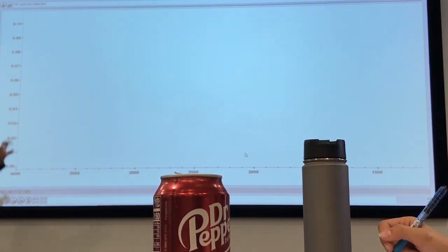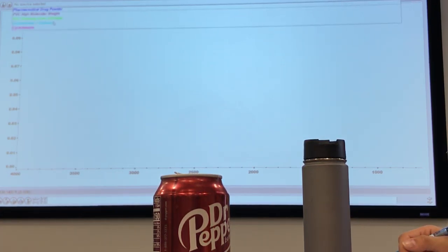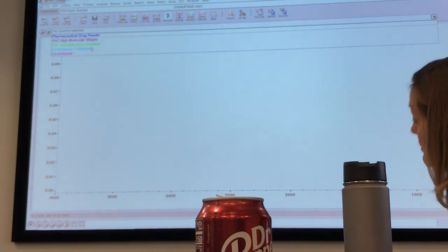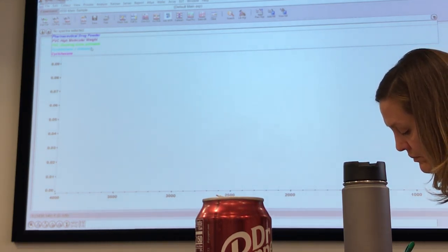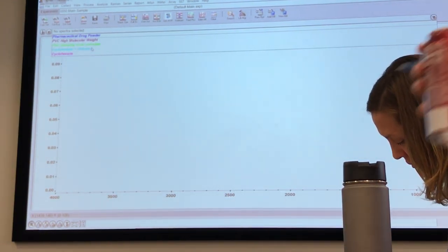That's why I want you to get more familiar with Omnic by itself and what it can do for you. So what we will do right now is take it as if we have run a spectrum. I will open a spectrum, and we will try to do a couple of things. One thing is search, a quick, simple search. What matters in searching would be the key right here, and what do the score values mean? How do we even think about whether the spectra matching is good or not? That's the whole goal of this afternoon: we learn to understand our spectra, not just because of what the software is telling us, but because we will do some eyeball tests on them, like, okay, what should we do next to understand this better.